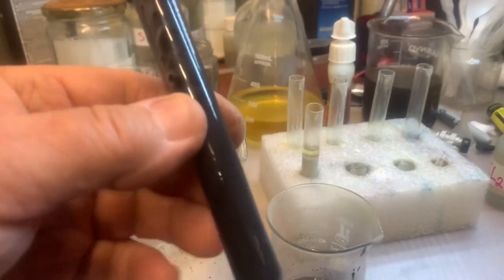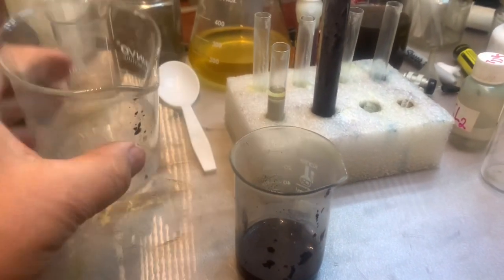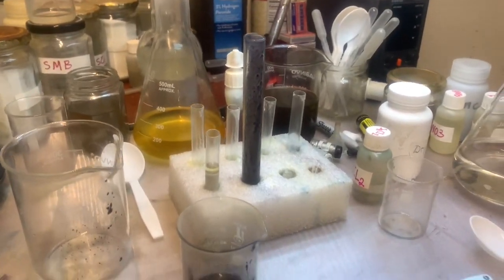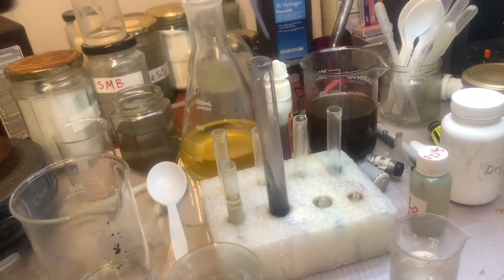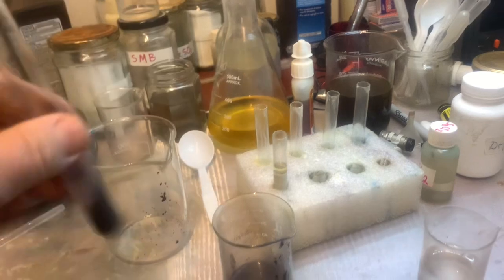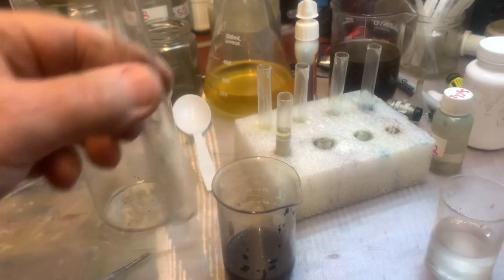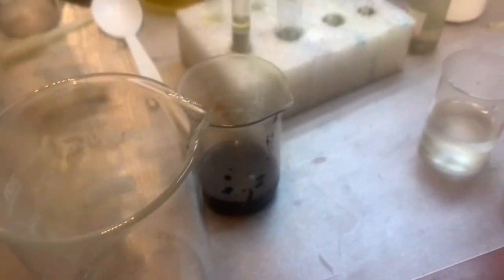Okay, see, he don't want to come out too, so I need to put the hydrochloric acid, wash everything, and we start dissolving this, putting heater on. Let's do it. Let me get some hydrochloric acid. Got some hydrochloric acid. I'll be washing this beaker and transferring everything to one place. Okay. One more time. Okie dokie. So it's clean. So right now we have some debris here. Need to wash everything in one place.